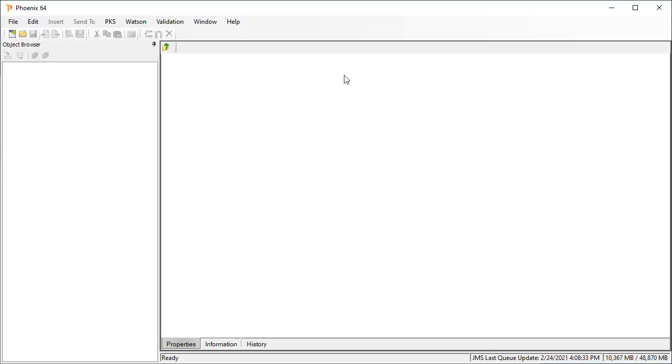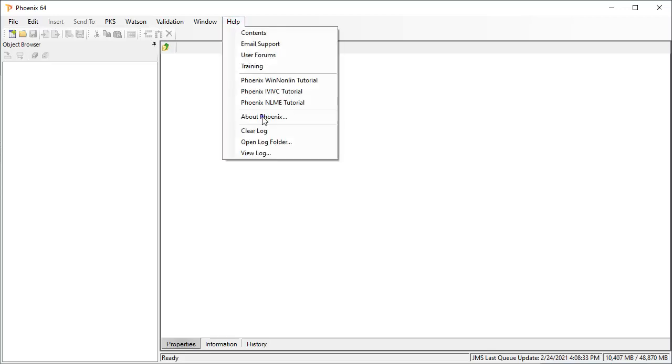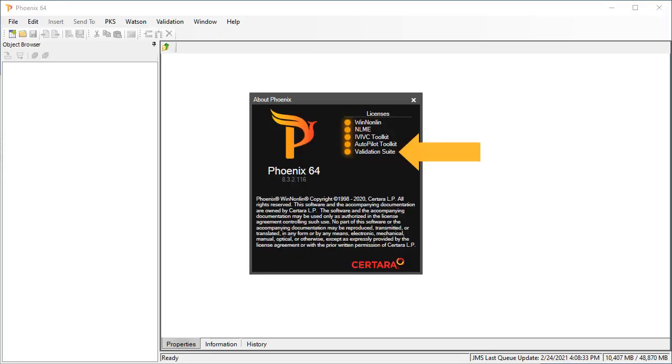To verify that you have a Validation Suite license, choose About Phoenix from the Help menu. Here you can see an orange circle right next to the Validation Suite, indicating that the Validation Suite license is active, so we can run the Validation Suite.